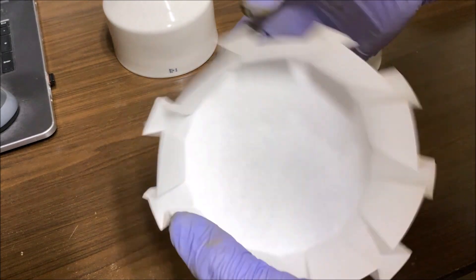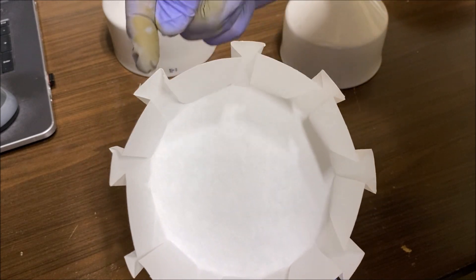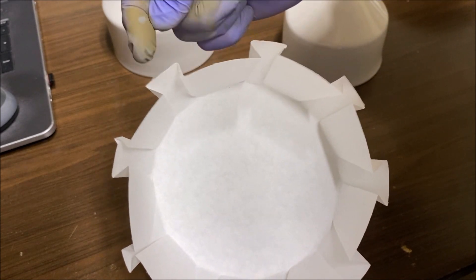Now I have a filter folded a certain way. See this shape right here? It's got to be this shape.